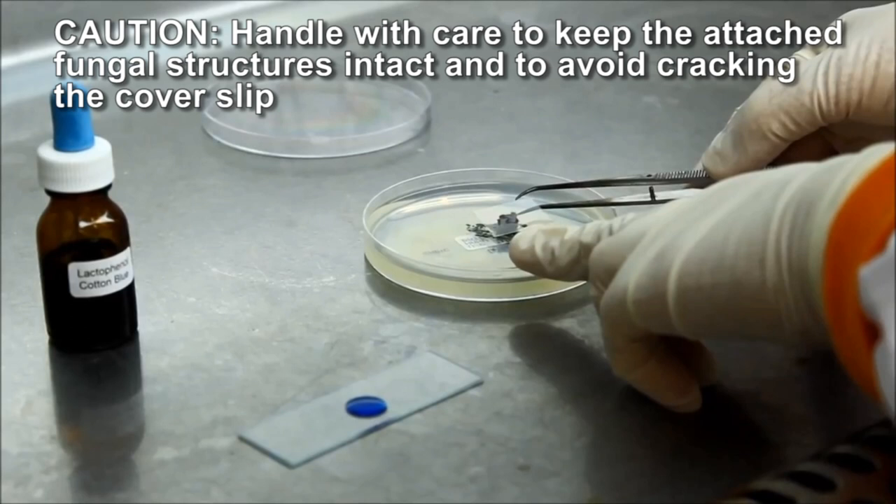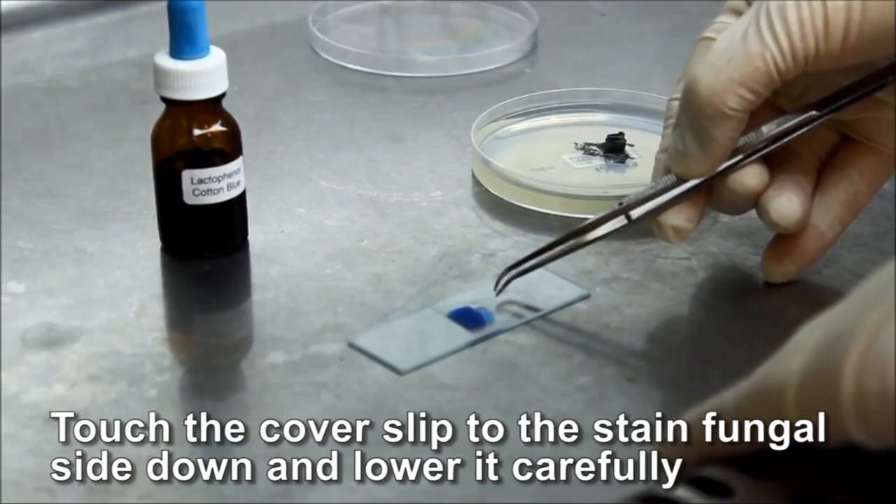Prize the coverslip gently from the agar block using a set of sterile tweezers. Place the coverslip by touching it to the stain at a 45-degree angle, then carefully lower it onto the slide, taking care not to form bubbles. The slide can then be observed under the microscope.